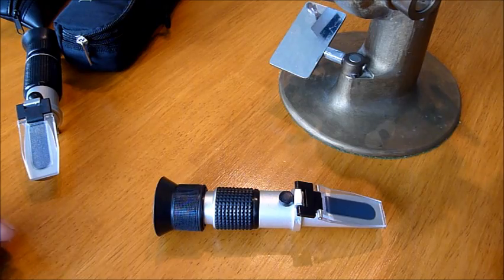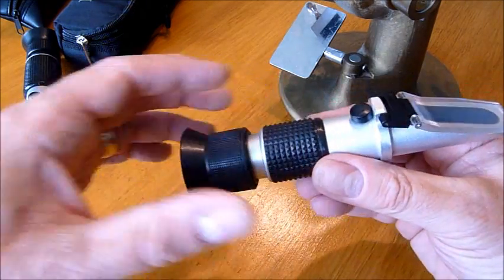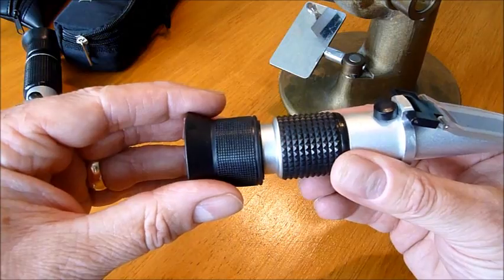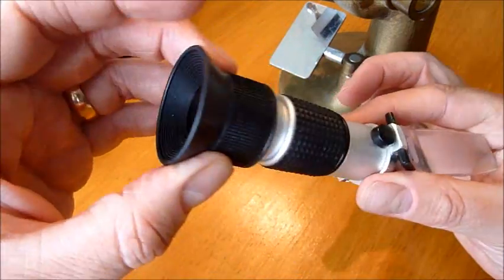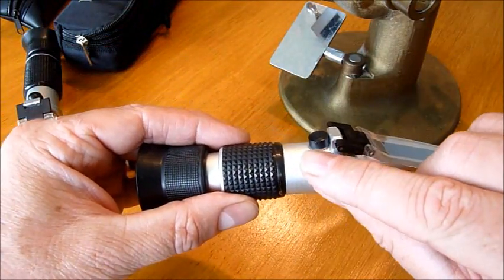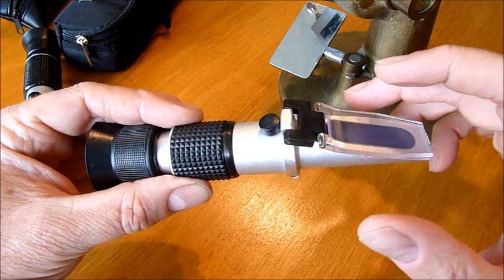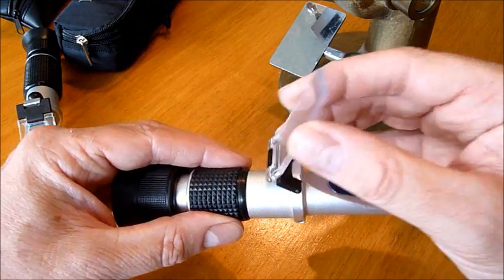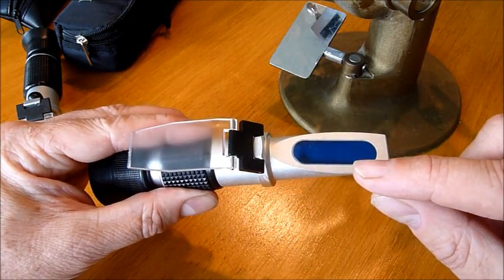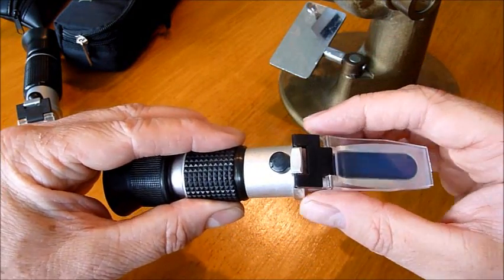Let's just refresh ourselves then. A honey refractometer. You have the eyepiece, we have the calibration screw that I'm not going to touch but we'll talk about that later. We have the prism where the sample goes and the prism cover.